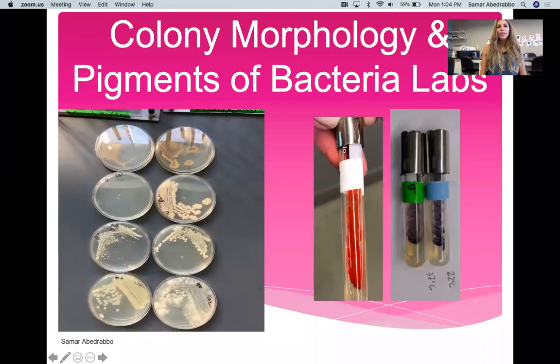Hi everyone. I'm going to go over the colony morphology lab and the pigments of bacteria labs. These labs are two different labs, but they're very similar, so I'm going to describe them in one video.